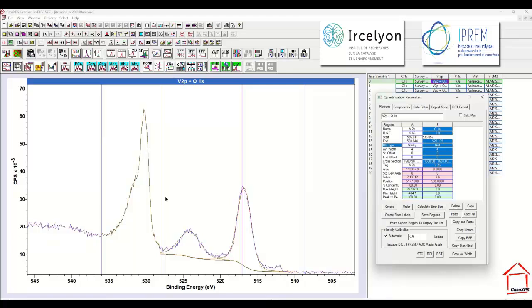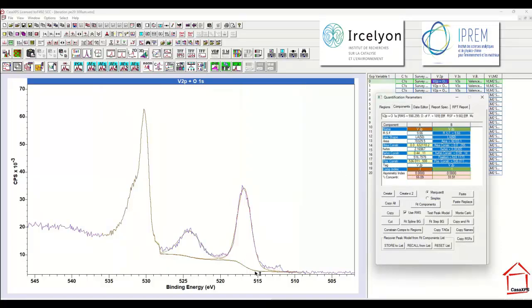So this is just a way of removing peak structure that I don't want to deal with as part of my peak model. Now I do need to add further information to this peak model, in the sense that I haven't accounted for this, which is now more obvious, metallic form of the vanadium. But even without the metal phase, I can see that the oxide that I've worked out looks about right.